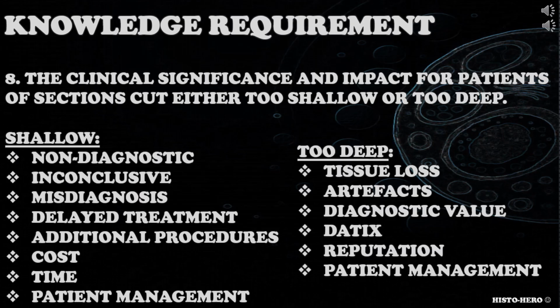When addressing this knowledge requirement, candidates should consider superficial or shallow sections and the non-diagnostic or inconclusive results, possibility for misdiagnosis, delayed treatment due to need for deeper sections, need for additional procedures, cost and time factors involved, inappropriate or delayed patient management. For sections that are too deep, they should consider tissue loss, introduction of artifacts due to aggressive sectioning or loss of diagnostic value within tissue block, Datix, and damaged laboratory reputation, affected patient management.